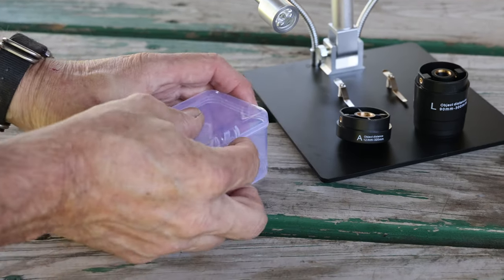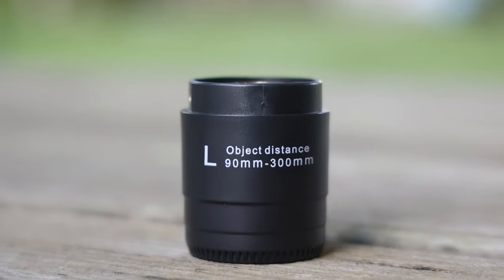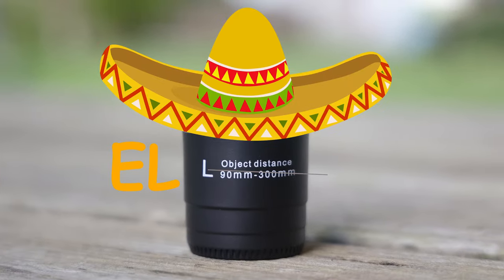There are three different lenses in a plastic box to store the ones you're not using. If you're working on watches or soldering, you'll probably want to use the 90-300mm lens, which would be lens L — or as they say in Mexico, the El lens.